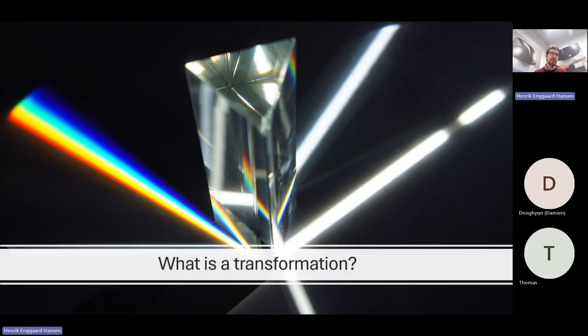We're trying to take our image data, which is in one form that might be intuitive or might be easy to measure, and then we take that data and put it into a form that's much more applicable to whatever domain or problem it is that we're working with. And this is then where we have to think about what kind of transformation makes sense for the kind of problem that we are working with.